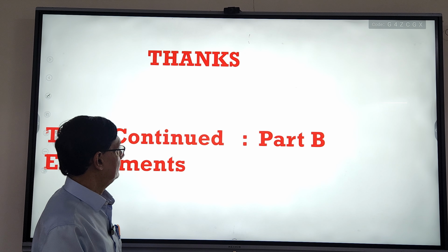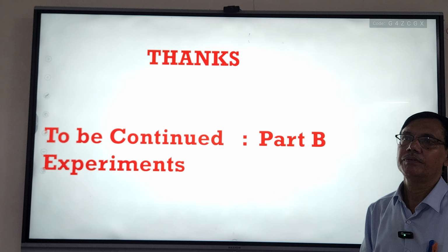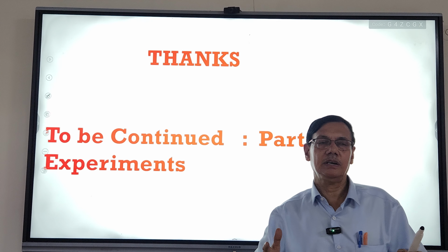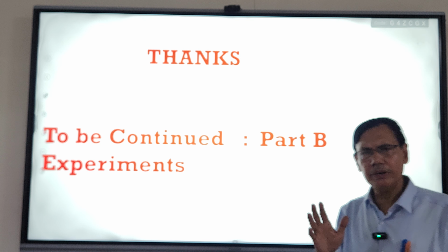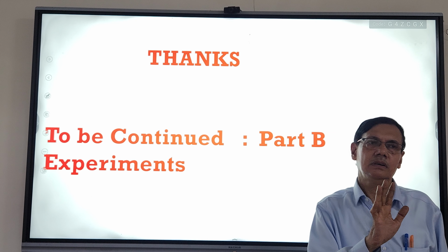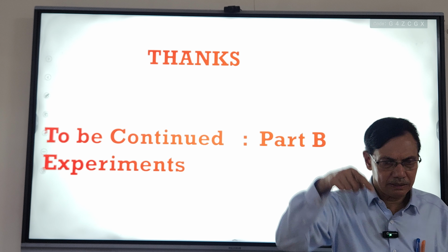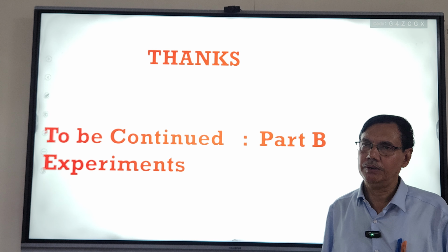So let me summarize that my objective is that today you have to perform the experiment CMC by the surface tension method using a very sophisticated equipment, Du Noüy tensiometer. For that, in this first part, I discussed some very fundamental aspects of the surface tension. What is the difference between the plate method and ring method, and how you perform the experiment.